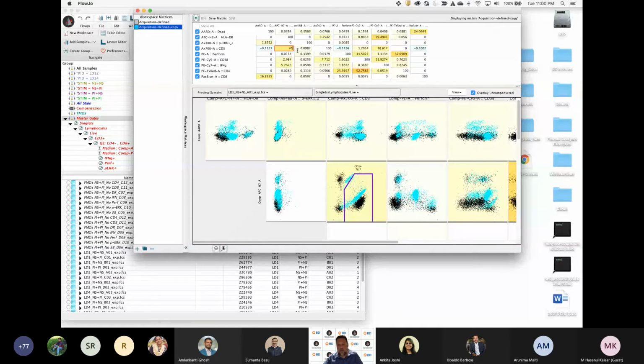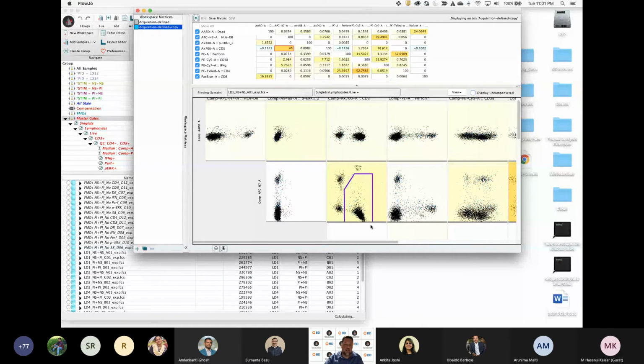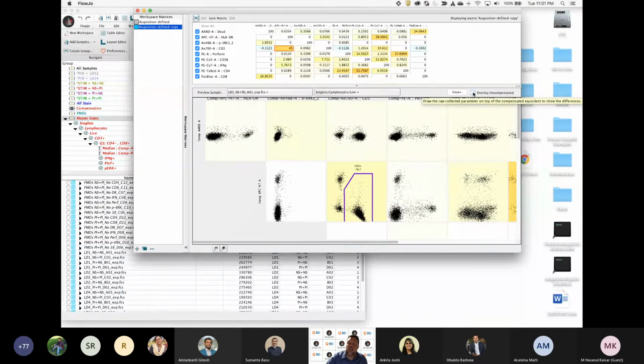Going the other way to 45, notice it's skewing off the edge, right? That looks very unbiological. It does not look square. It is an overcompensated interaction. And as you get used to looking at these, you will notice that in the preview and be able to focus in on that and ask, why is that not compensated? Maybe it's not the right compensation control. Maybe it's a mismatch. Again, good compensation comes from having good single color controls in the first place.